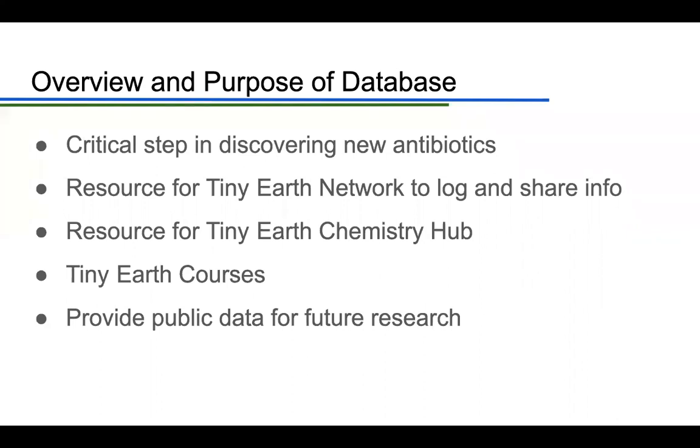It's a big resource for us here at the Tiny Earth Chemistry Hub. It's one of the main ways that we connect with your information. We use all the isolate information that you enter to do some of our preliminary screening. We love all of the uploads that you put in there, the tests that you log, the notes that you enter, and any pictures. It helps us to know more about your isolates.